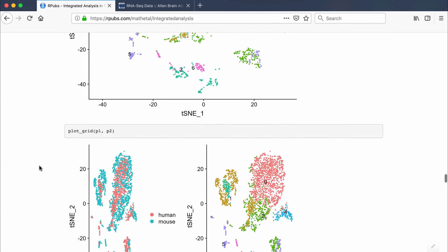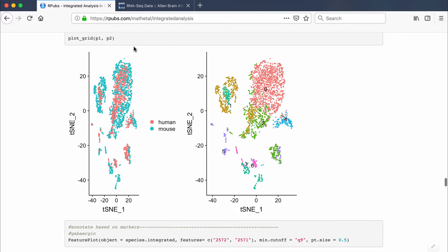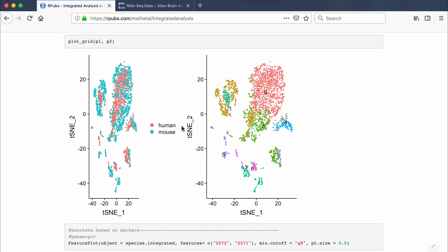In this video I'm going to go over how to do integrated analysis, also called anchoring, in Seurat. If you have single-cell RNA-seq data for multiple conditions, multiple time points, or multiple species, and you want to compare or integrate across different Seurat objects, you can do that using anchoring in Seurat 3.0. For this dataset I'm comparing human and mouse, and I can produce a combined t-SNE plot that integrates the two species so you can see the similarities and differences.